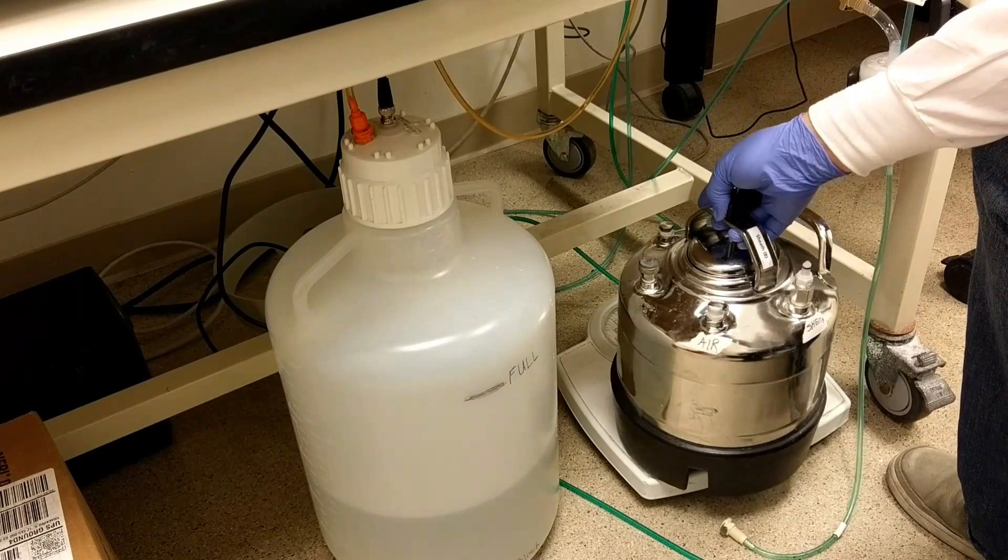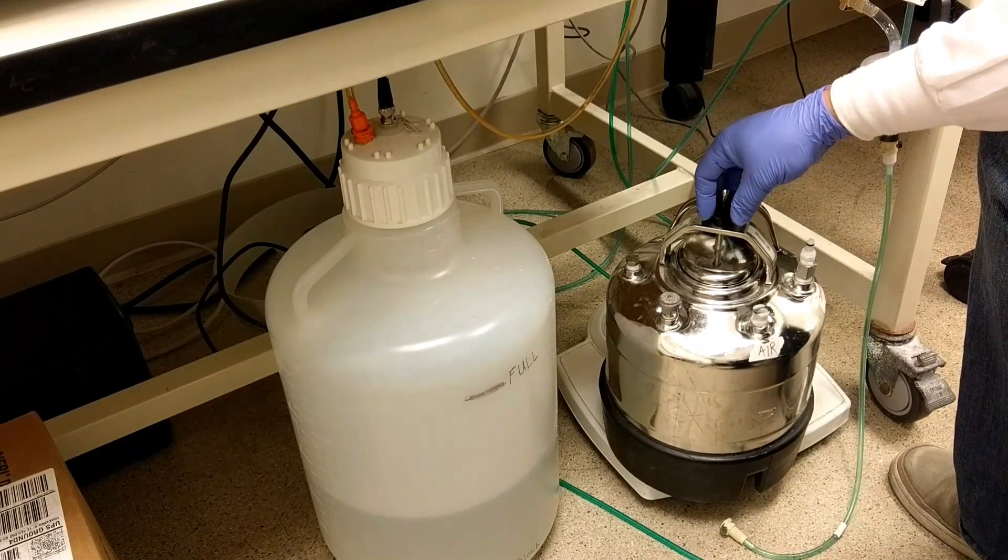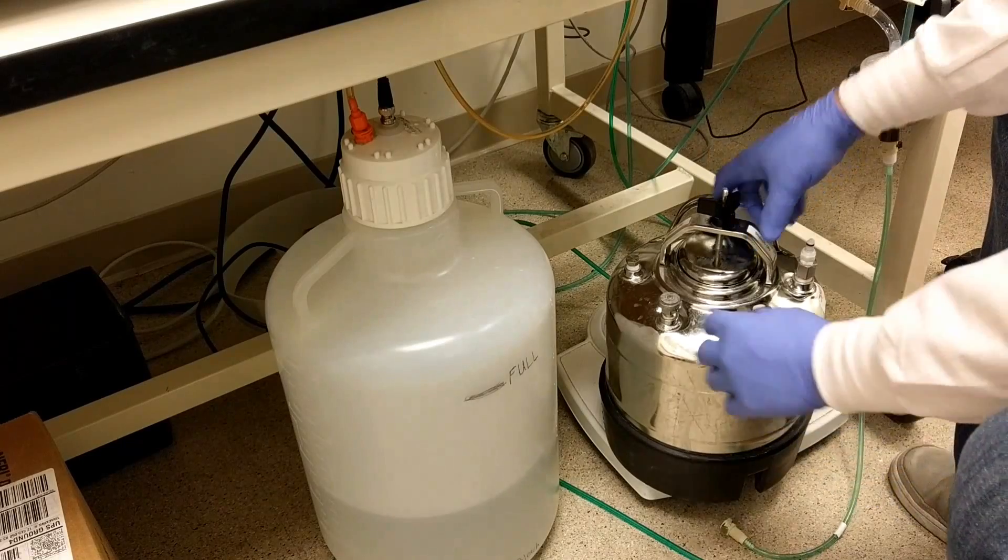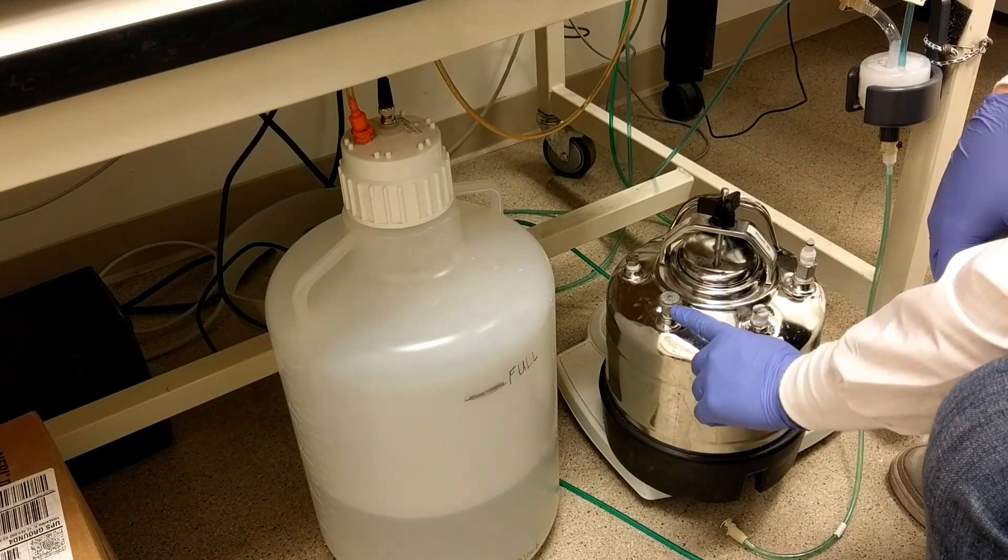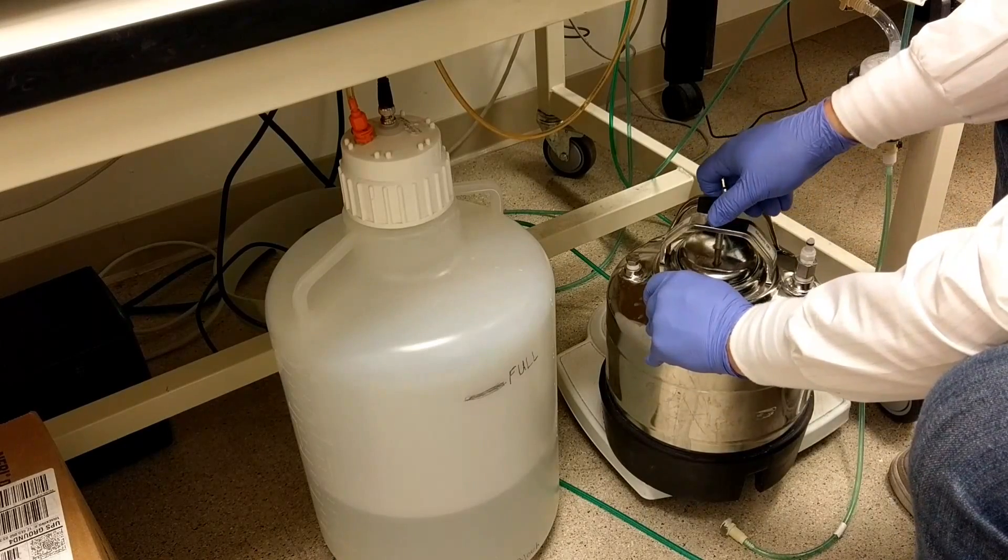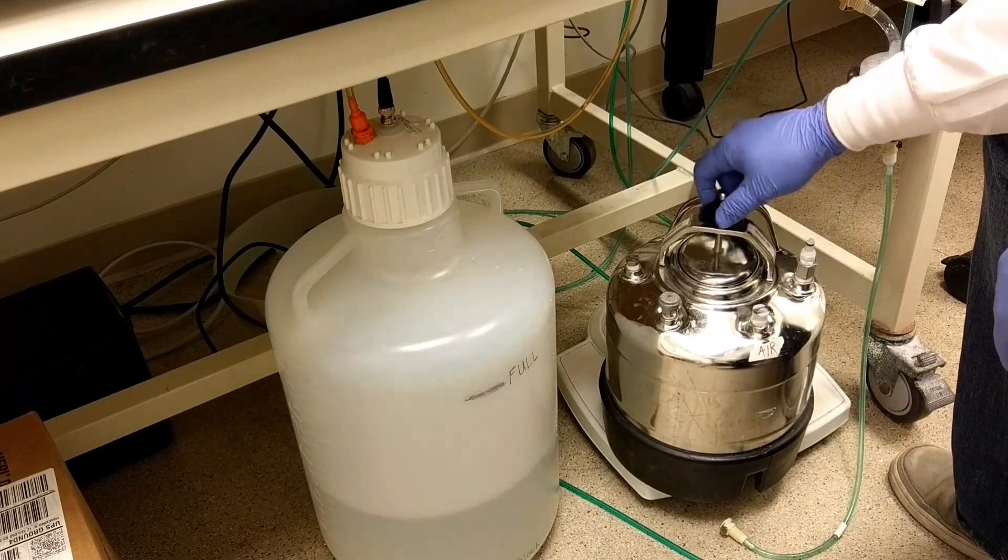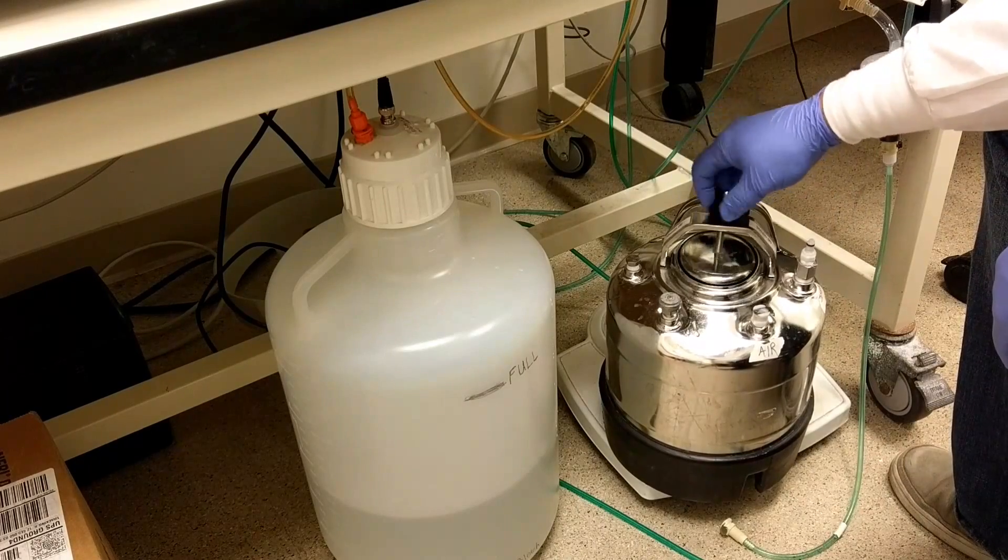In addition to removing the lines, you'll have to depressurize the tank or you'll never get the lid open. To depressurize, you're going to lift up this pressure release valve and you should hear a hissing of air. Then you can unscrew the lid and now the tank will be able to open.